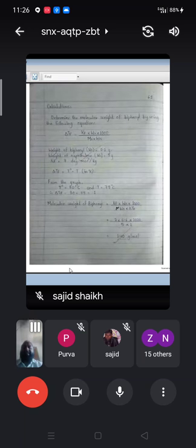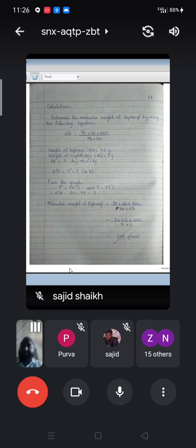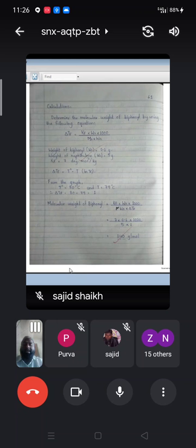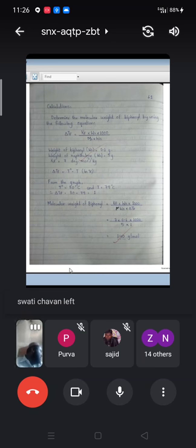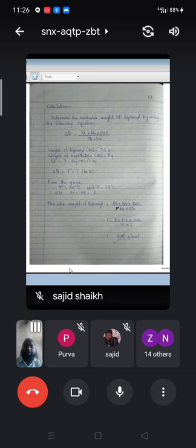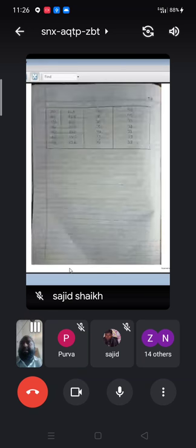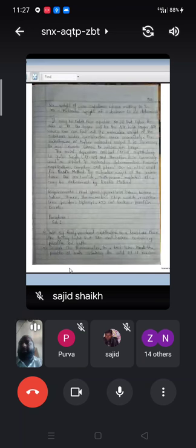This is a very simple experiment. We take naphthalene in one test tube and the mixture of biphenyl plus naphthalene in another test tube. We melt the naphthalene above 5 degrees centigrade of its melting point — naphthalene has a melting point of 80 degrees centigrade, so we heat it to 85 degrees. Then we remove the tube from the paraffin oil bath, keep it in the dry beaker, and record the temperature using a thermometer inserted in the tube. This same procedure is described for the Rast method in the theory section.